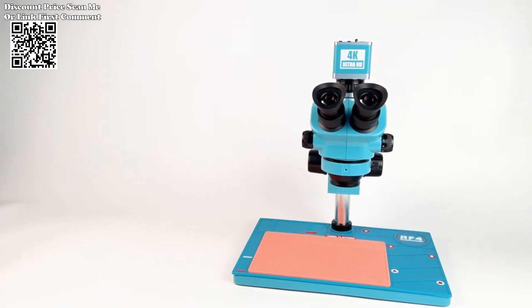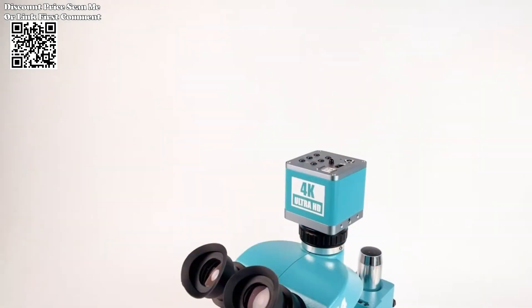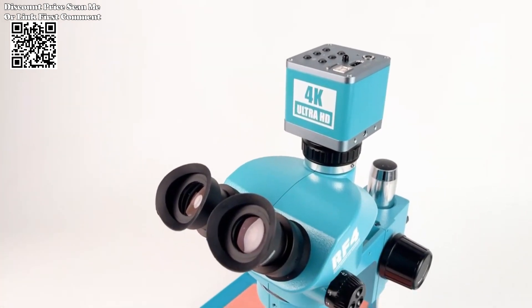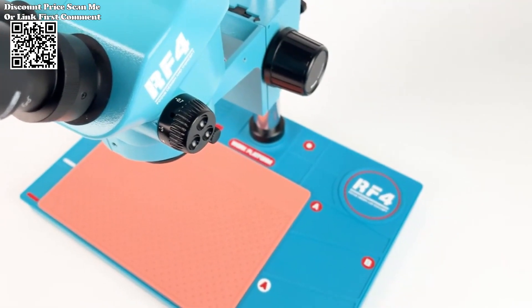Upgraded Electronic Eyepiece: Say goodbye to dark angles and distorted images. The new upgraded electronic eyepiece delivers crystal-clear images with a wider field of vision, ensuring that every detail is captured with utmost clarity and accuracy.